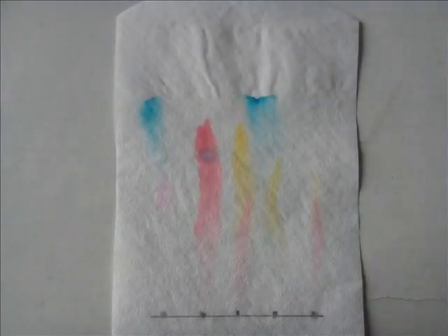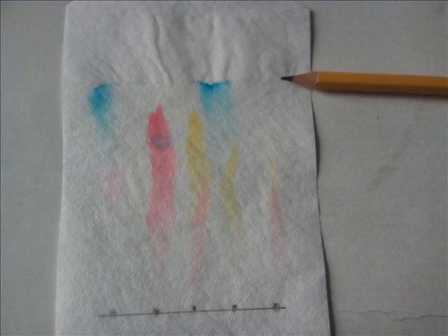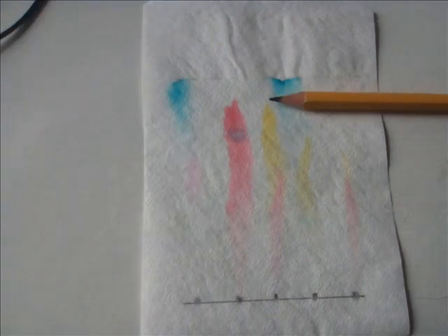This is what I started off with, this is what I got, and I measured the distance between the baseline shown at the bottom and the front, which my pencil indicates, and also I looked at a yellow dye and I indicated the front of my dye.